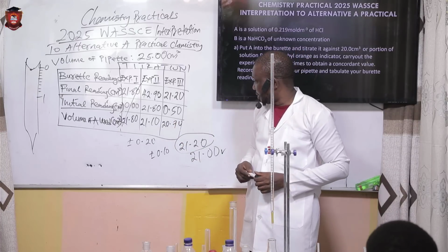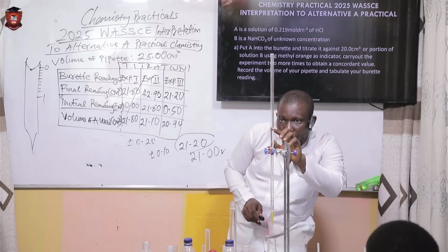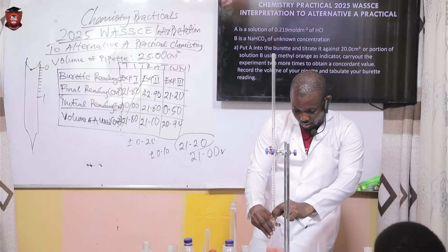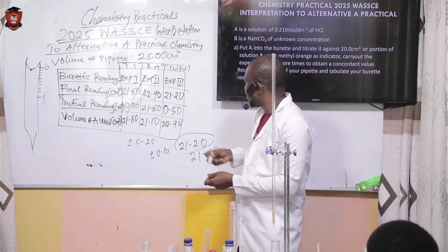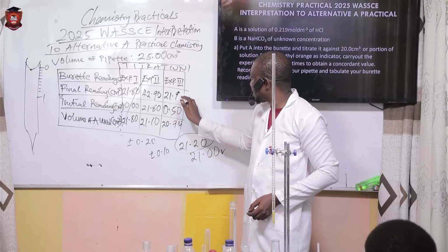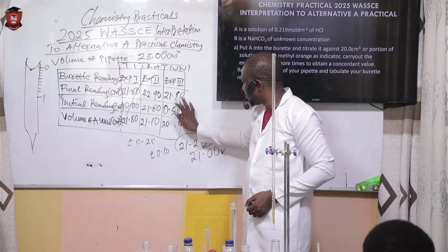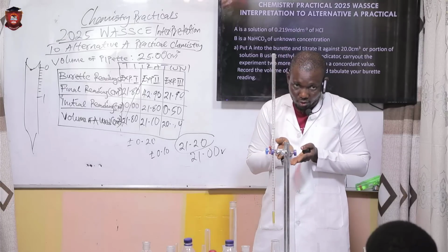So if it is something like this, what will we do? Okay, we'll adjust. Maybe you add on the titrant. So it was supposed to be 21.90. Okay, now subtract. Let's see. 21 point what? 40. Okay, now you still need to adjust it until it's consistent.